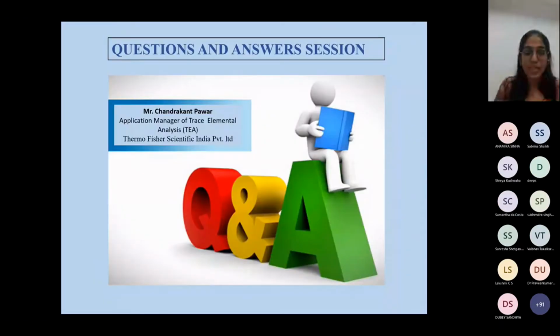Thank you, sir. Let us begin with today's question and answer round. The first question is by Dr. Daminder Singh. He wants to ask how we can find the values of CHNS manually. Can we have the manual calculations for CHNS?